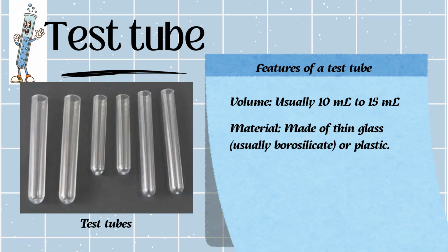Always remember that we do have test tubes of volume less than 10 ml, but they are used for micro testing level, when we have very small scale reactions, especially in microbiology labs. Since we do not use them in the laboratory that we have in our school, I'm not mentioning those test tubes here.